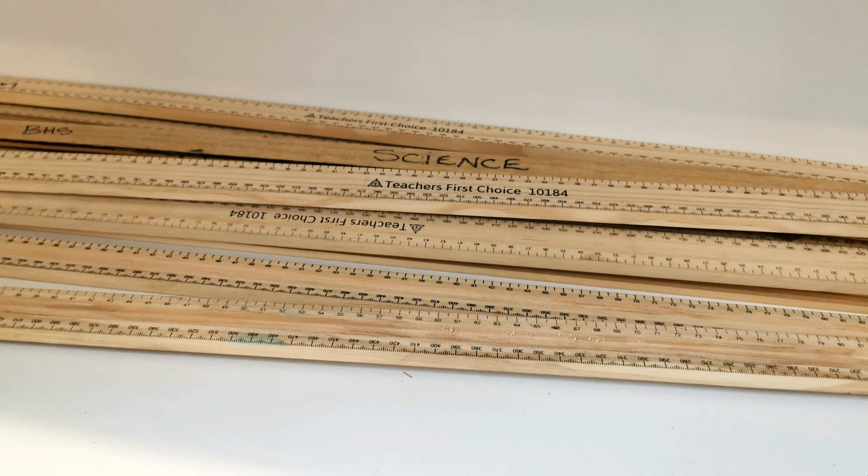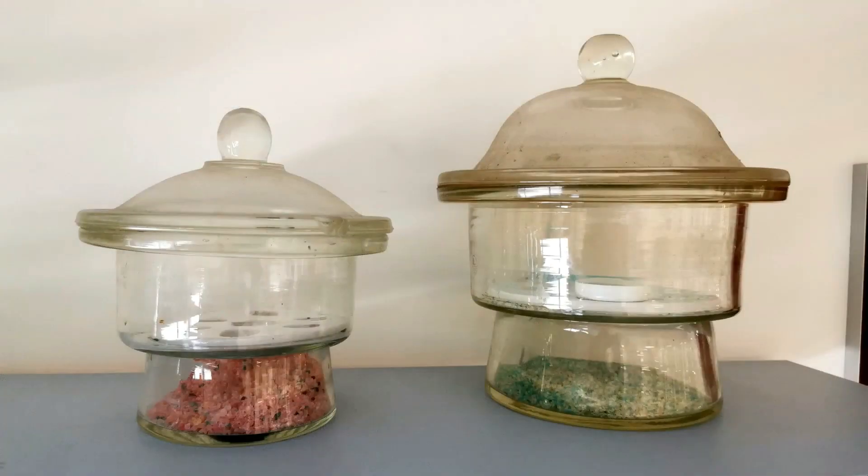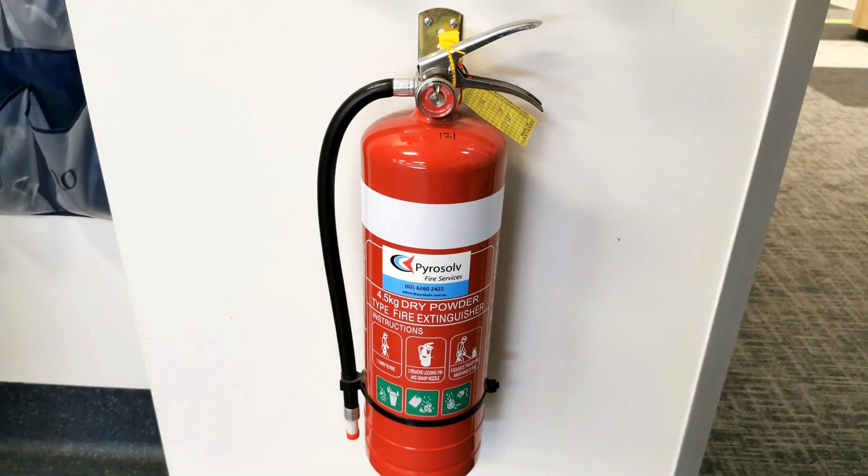Sometimes you just need to measure stuff — you want to roll a trolley along the bench or see how far something goes — just use a meter ruler. This is a bell jar and lid. And then we have desiccators — used to dry things. The crystals in the bottom absorb moisture, so you put your substance into the middle layer and leave it overnight or for a week, however long it takes to dry out.